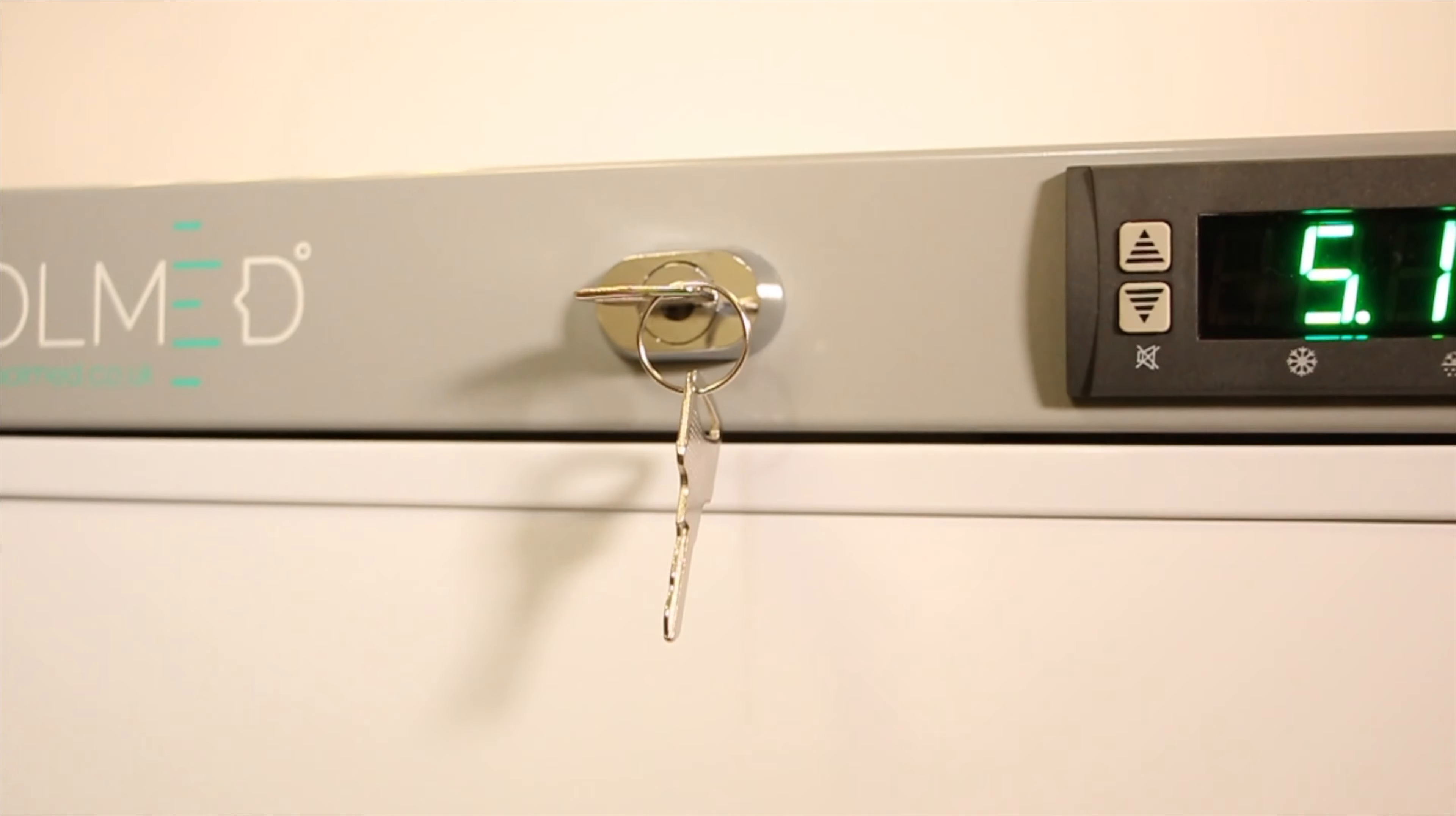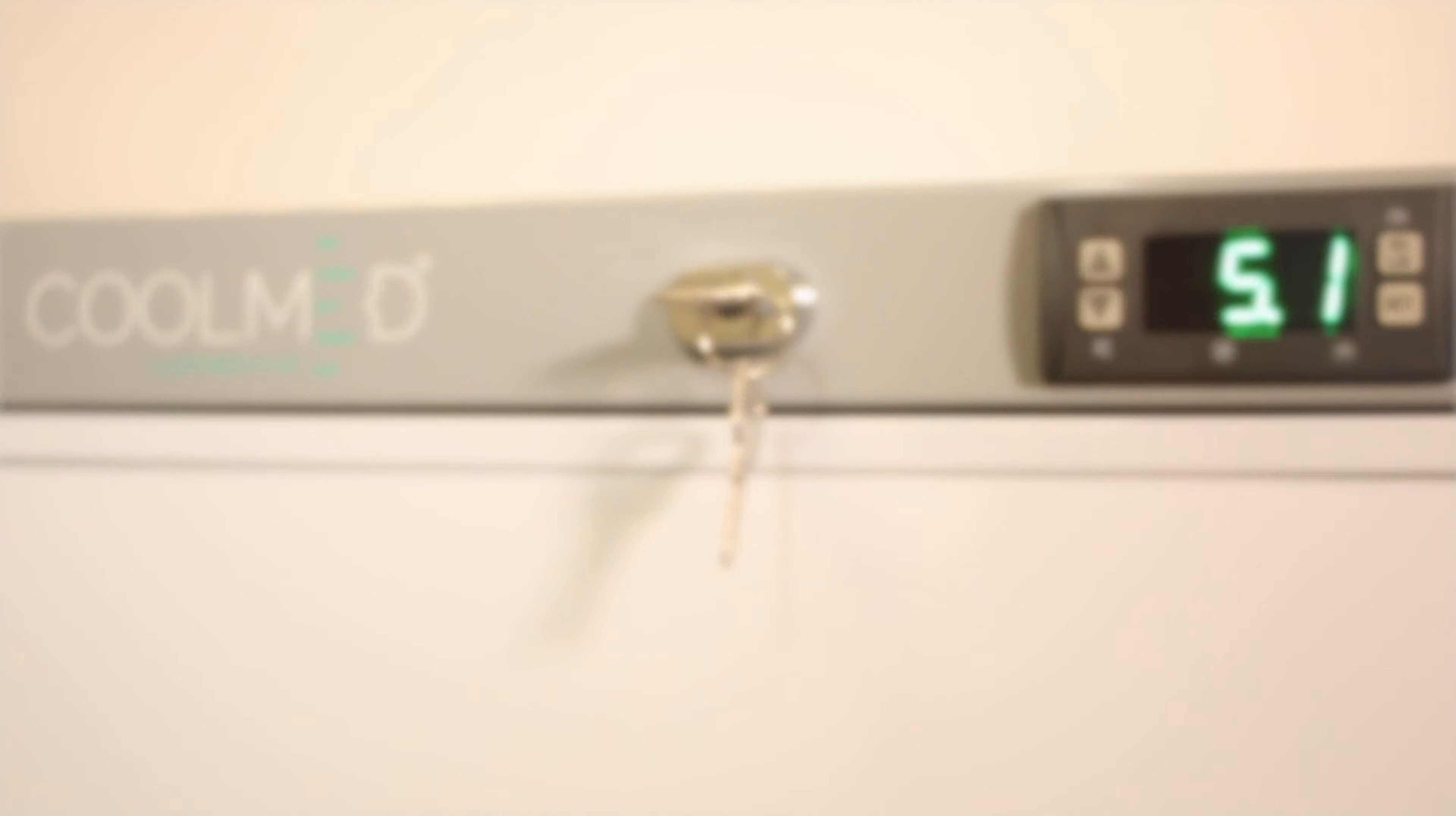Each fridge comes with a lock and two keys to ensure your drugs are kept safe and secure.